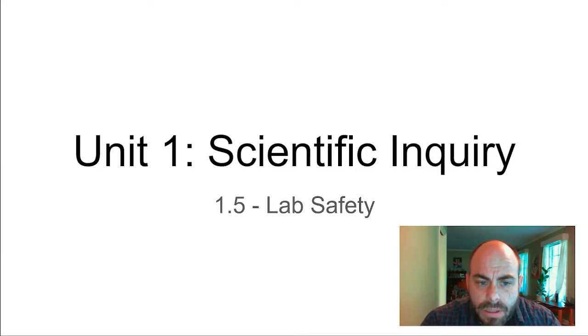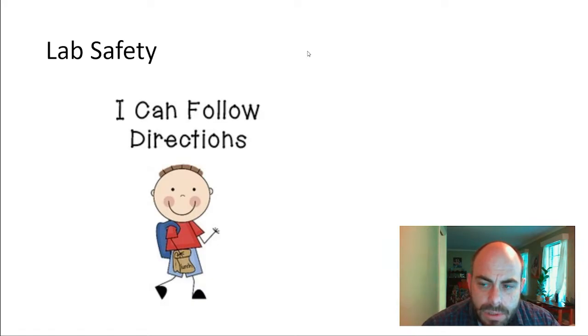In this video, we're going to be talking about lab safety. This is 1.5 lab safety, number 5 section of Unit 1, scientific inquiry. So we're going to be talking about some different topics. The first one is the most important, following directions. Hopefully you too can follow directions. Following directions is the number one way to prevent any lab safety issue in the classroom.